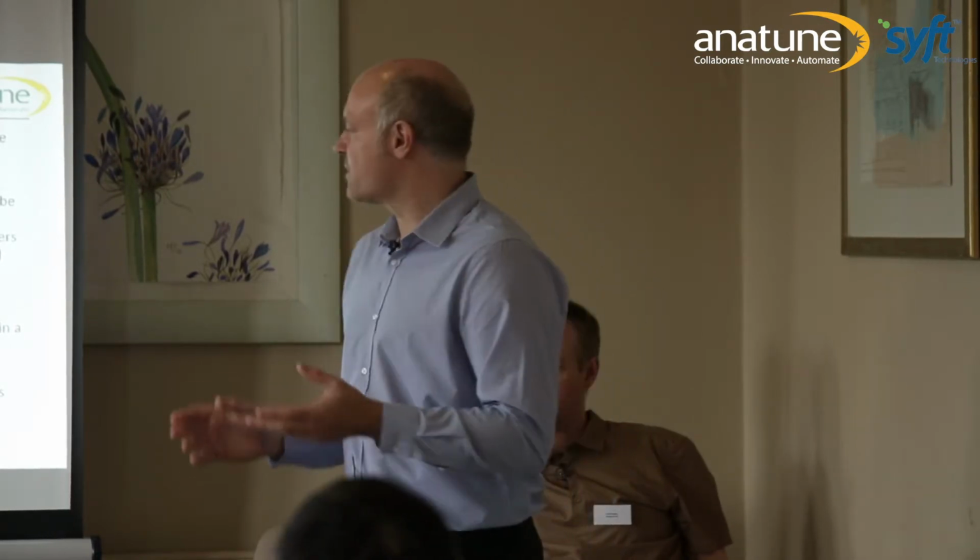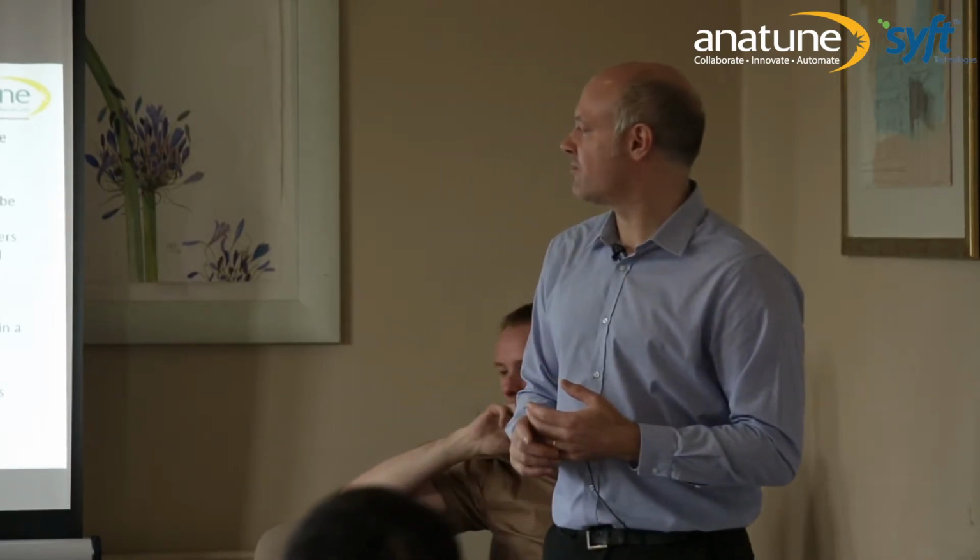So you've got to look at your instrument and say what things vary that I can't control, and then rerun some test methods with the instrument in that modified state. With the SIFT-MS, really the only things that varied were the temperature of the inlet and the temperature of the flow tube, because they have a tolerance in which they move about a bit, about plus or minus 7 degrees.